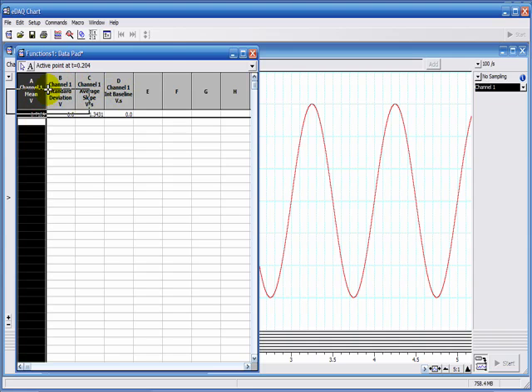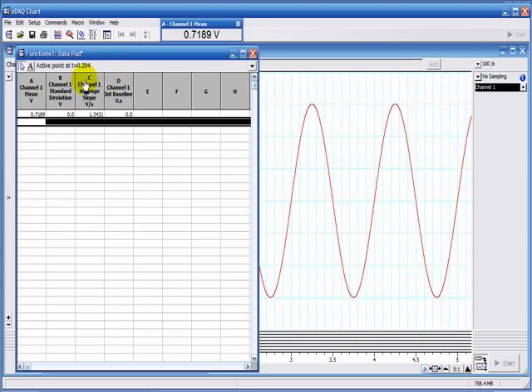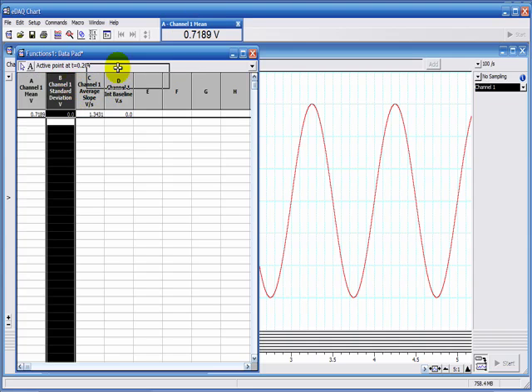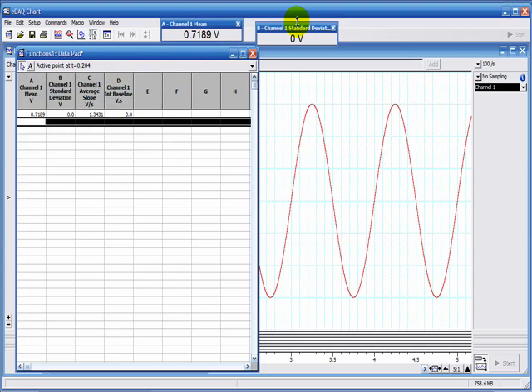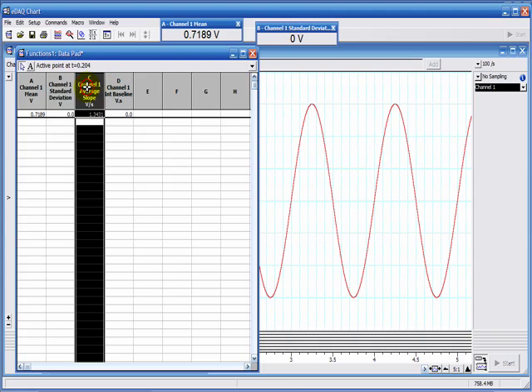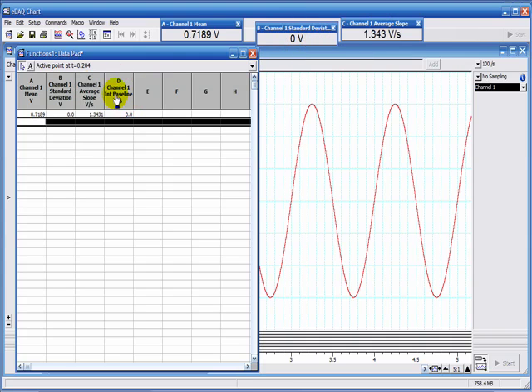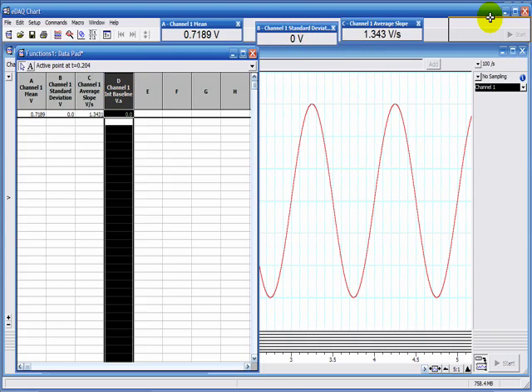I can drag these column headings to the chart window. So this is the mean, the standard deviation, the slope, and the baseline.